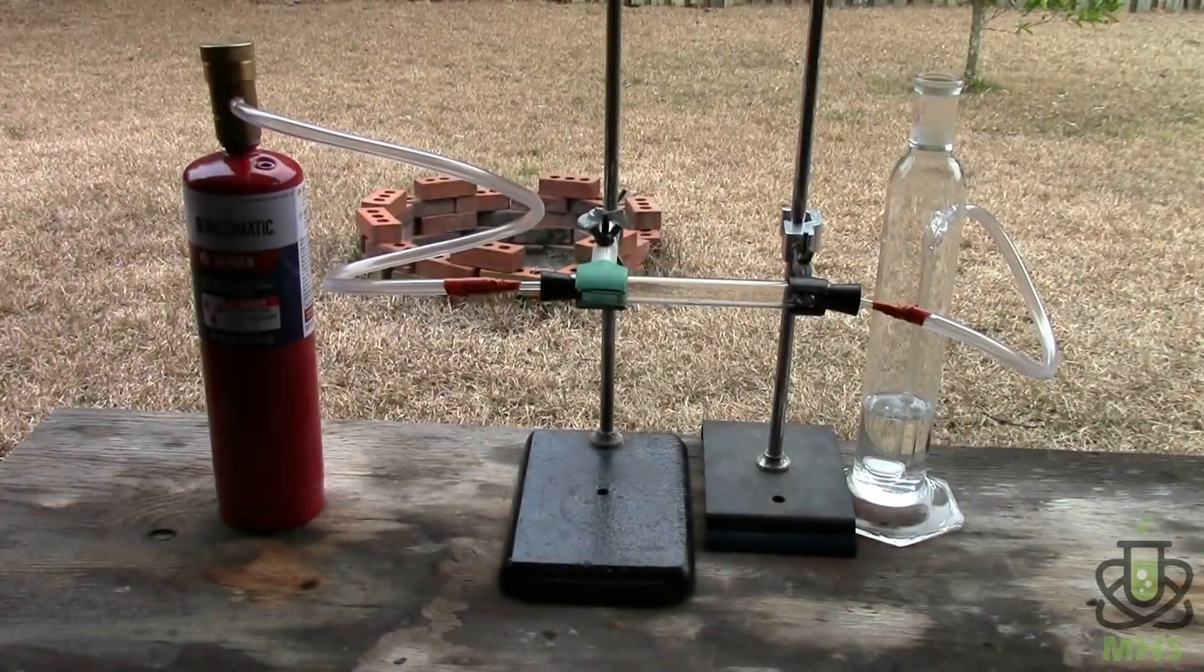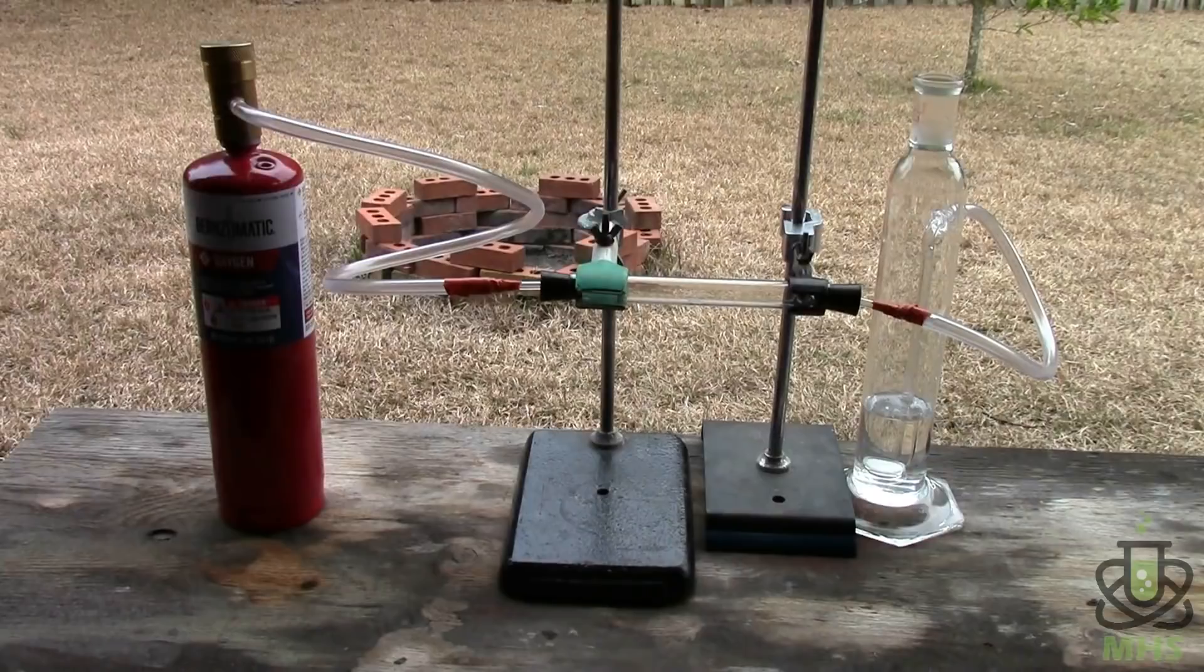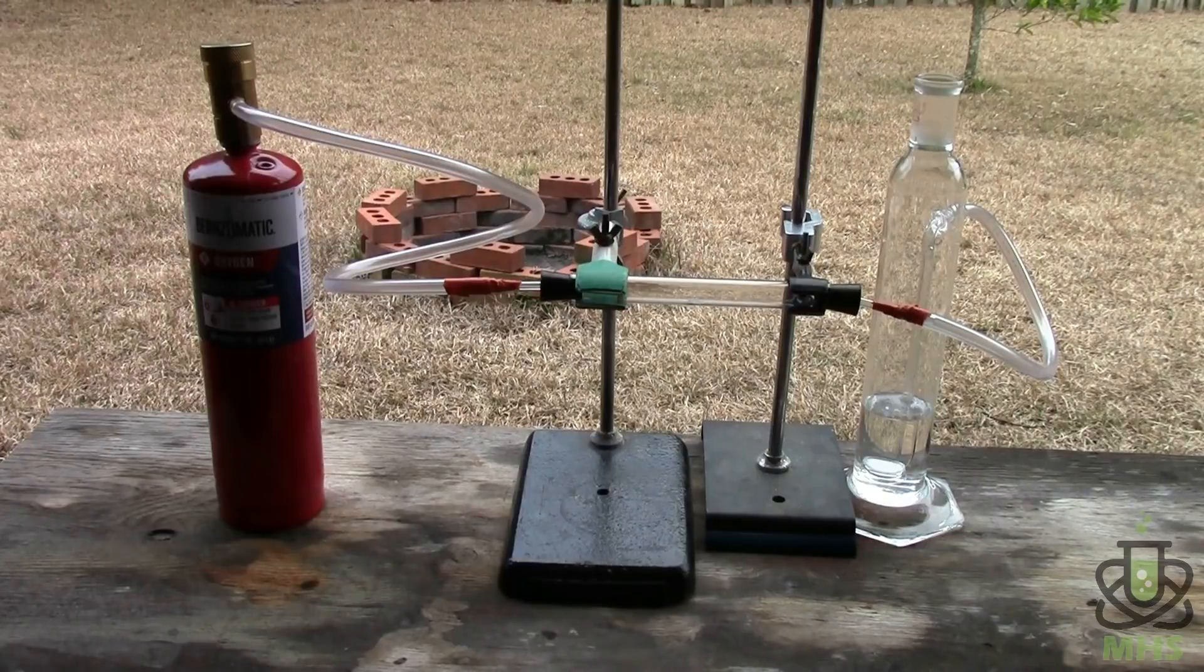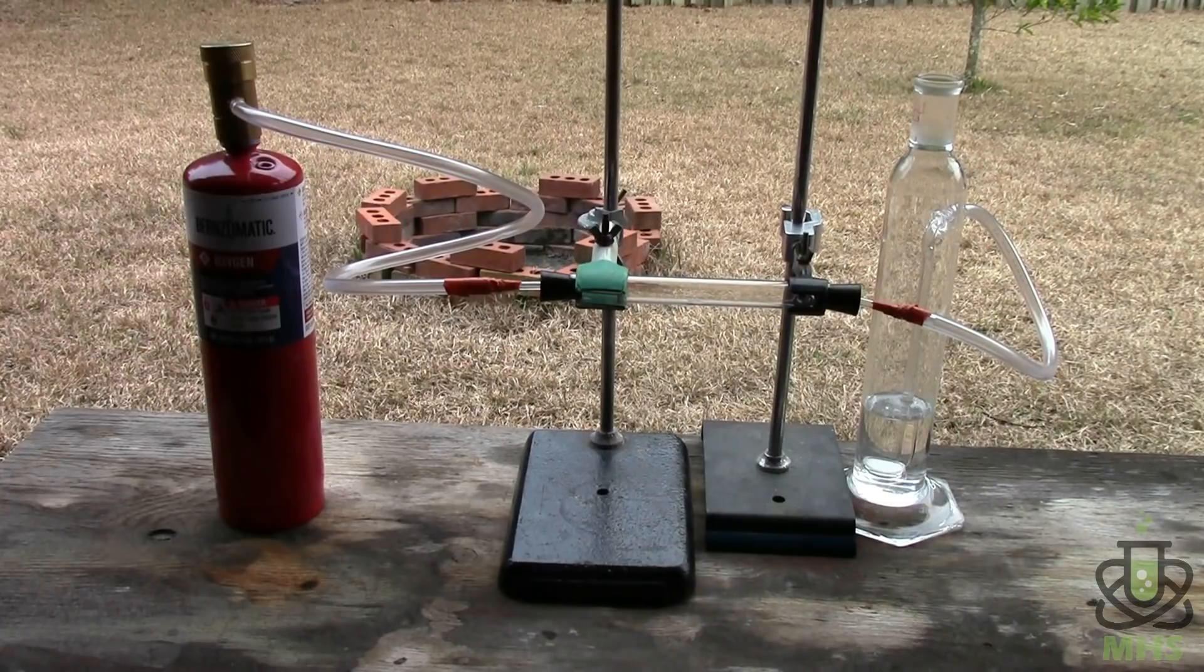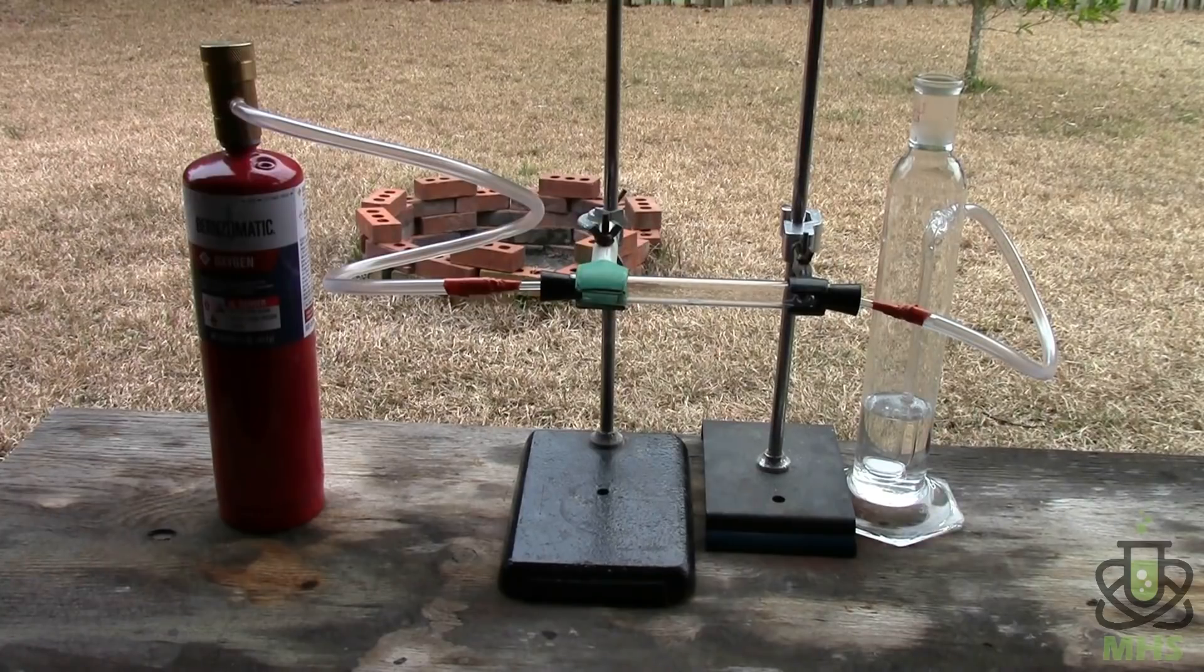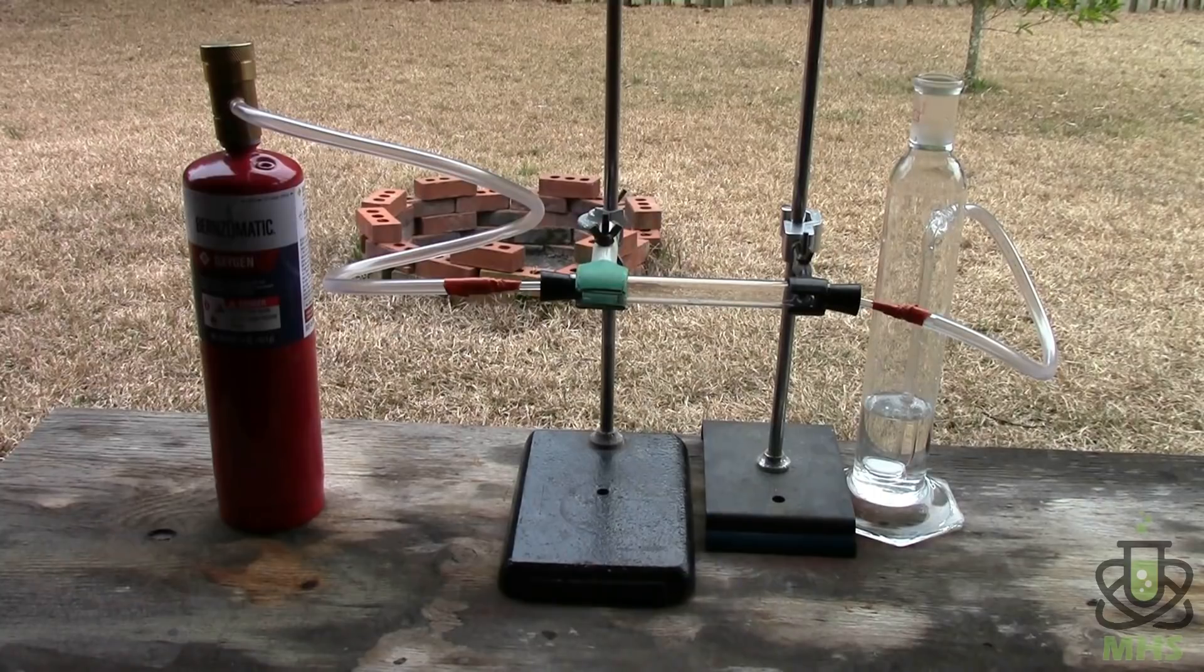So here's the assembled apparatus. You see on the left we've got the oxygen cylinder which leads via hose to a stopper in the left-hand side of my quartz tubing and the diamonds are inside that quartz tubing in the center. And then there's another stopper on the right-hand side which leads via hose to my gas wash bottle which is currently filled with 100 milliliters of lime water.